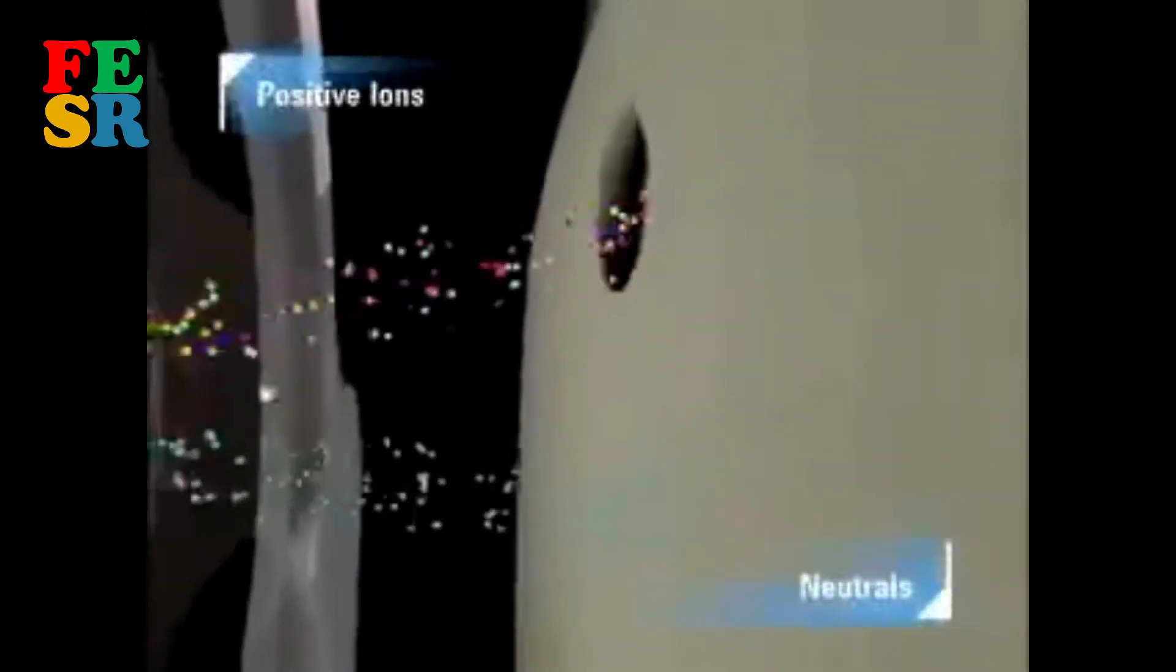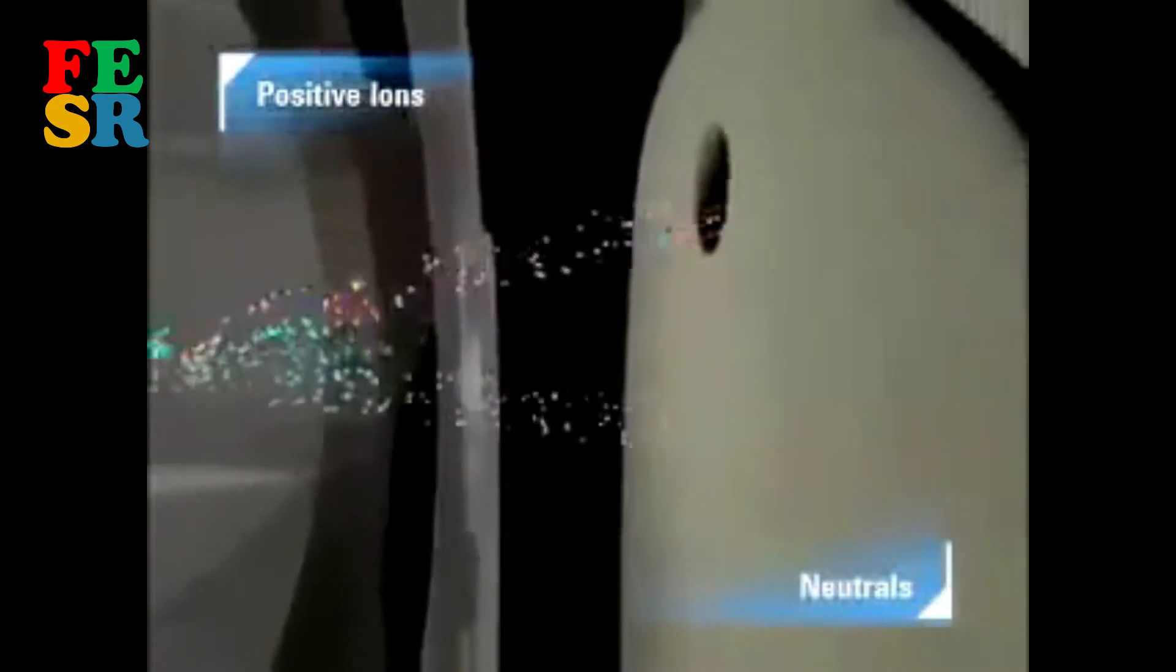Electrostatic lenses focus the ion beam and separate the positive ions from the unwanted neutral species by bending them into the reaction cell, the heart of the octopole reaction system, or ORS.